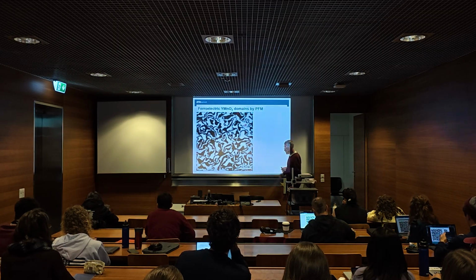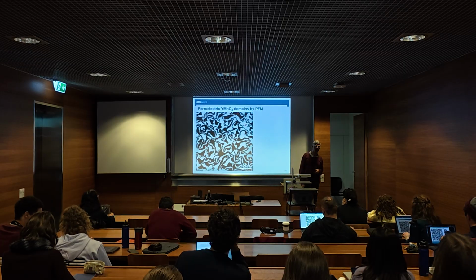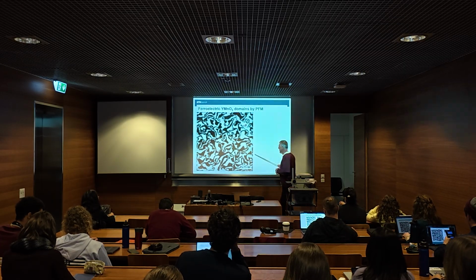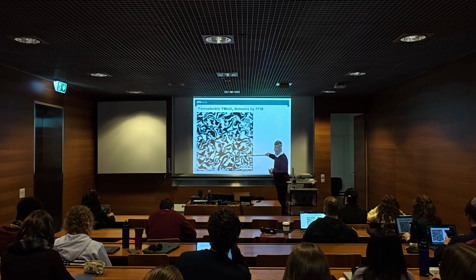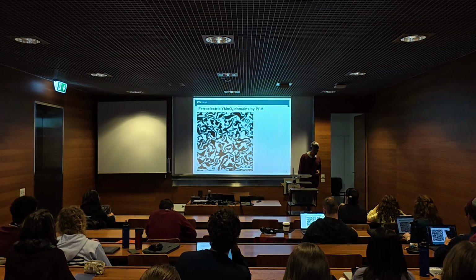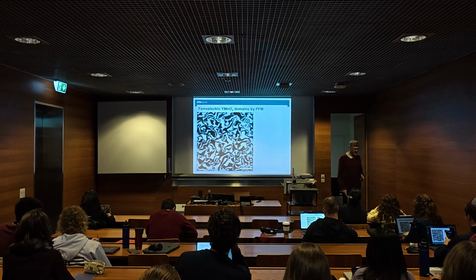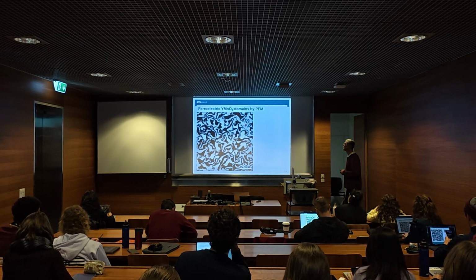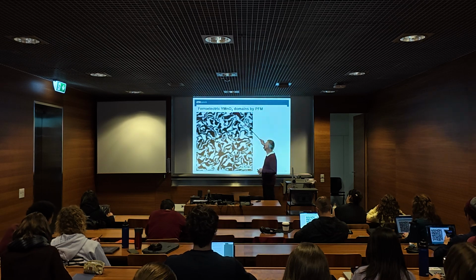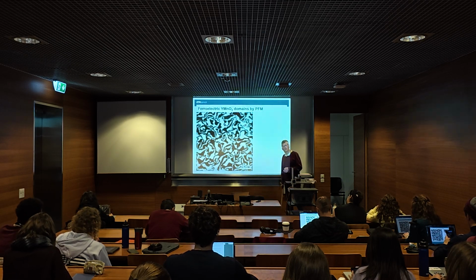This big pattern was recorded using piezo response force microscopy. It's a ferroelectric yttrium manganite sample. I showed the material a number of times, and I'm showing it here because first of all it's a nice picture. It's really high quality, as you see, and look at the resolution. Much better than optics, for example, and in any case way better than neutrons. And then you have these plus and minus polarized regions showing up as bright and dark areas.